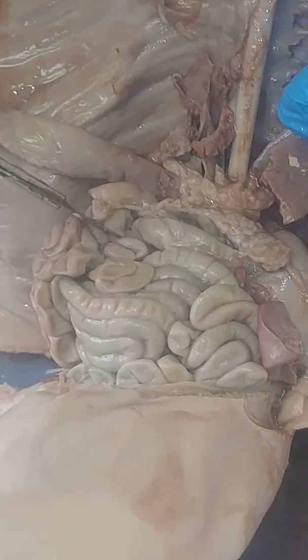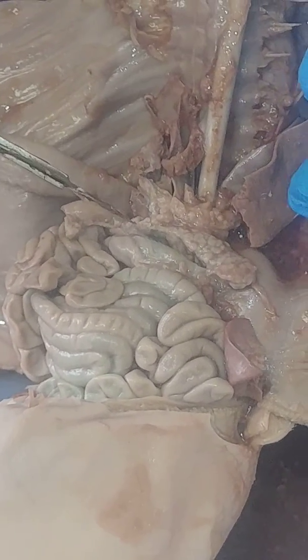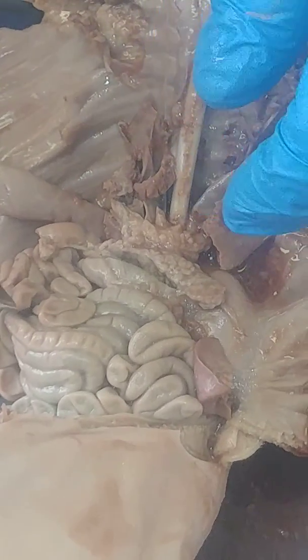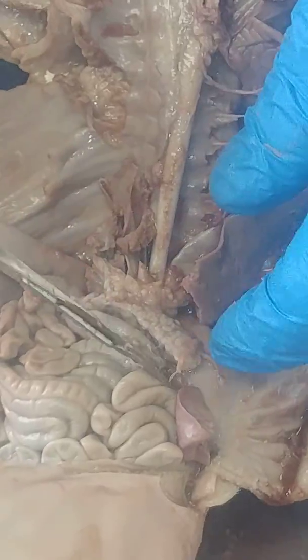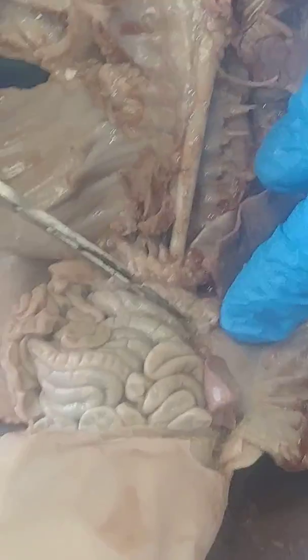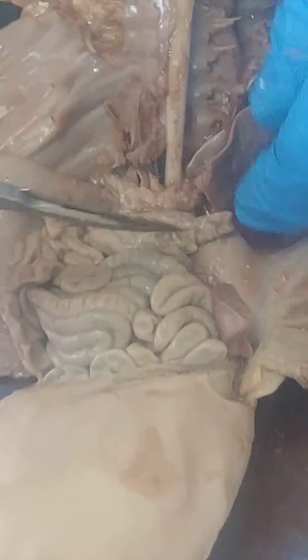It's a little globular organ located under there. It hooks into the small intestine here with the pancreatic duct to secrete those things to help break down all the different sugars and proteins. Some of the proteins are broken down in the stomach with hydrochloric acid and some pepsin. But you have things like stuff that breaks down regular sugar, sucrose, an enzyme called sucrase. And then if you have a malt, there's maltose type of sugar, and maltase is the enzyme that helps break that down. But that's all produced by this little organ right here.